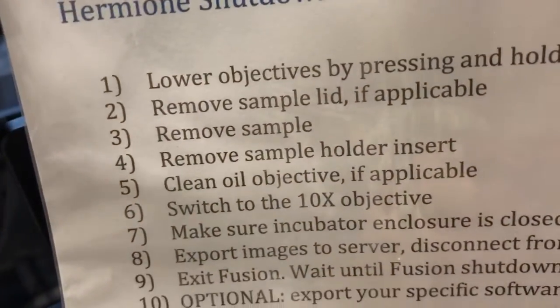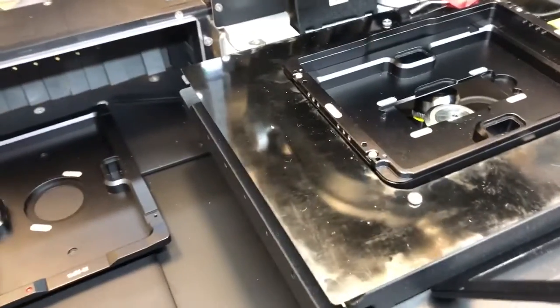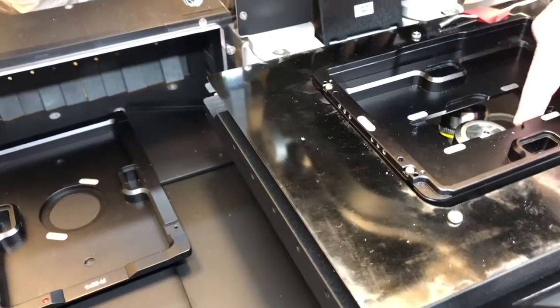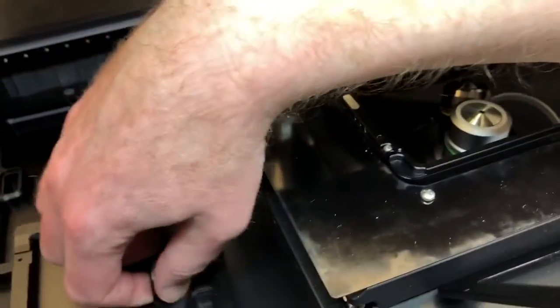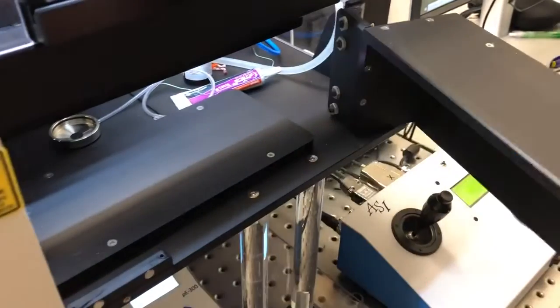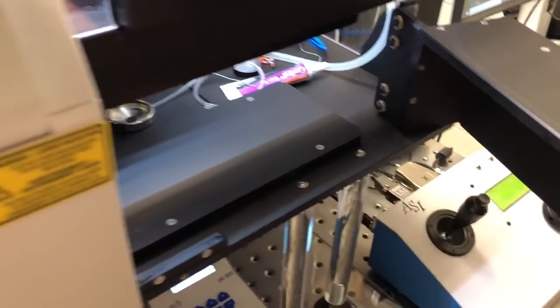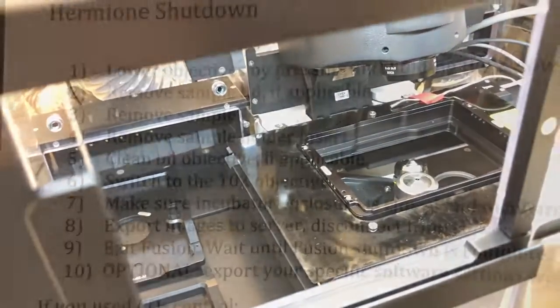The next step, step four, is to remove the sample holder insert. We're going to pick this up and put it either here or alternatively you can put them there. We want to keep the sample holders — at least the ones that are used frequently — inside the enclosure so that they are at the proper temperature.